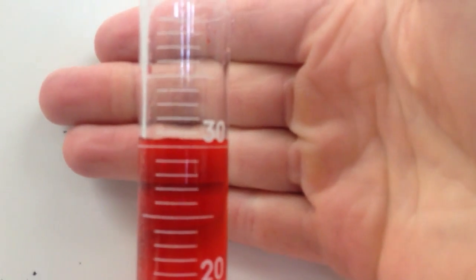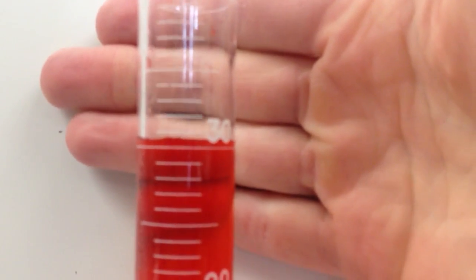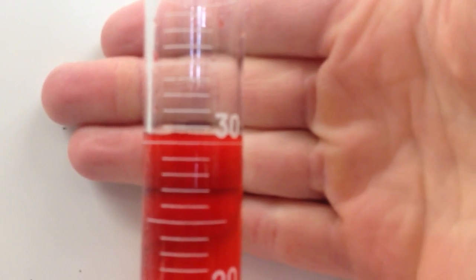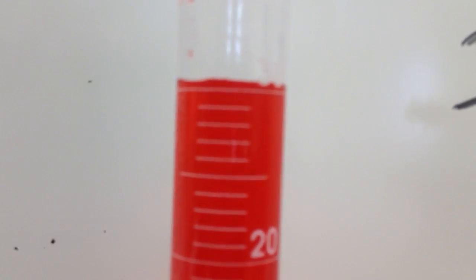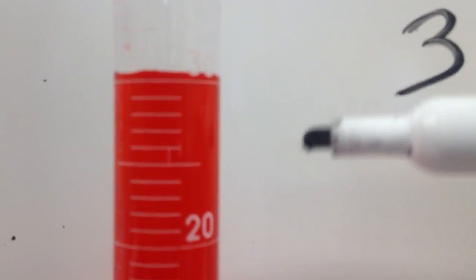So let's look at my water level. My water level, see the meniscus or the top of my solution, it's more than 30 but less than 31. So I can estimate the difference between those. It's hard to tell in the video, but I'm going to say it's about 6 tenths of the way to the 31. So I'm going to say that that is 30.6 milliliters.